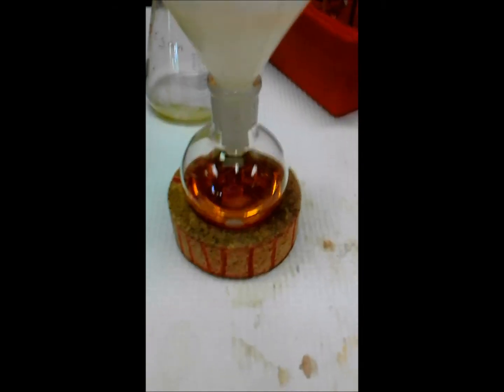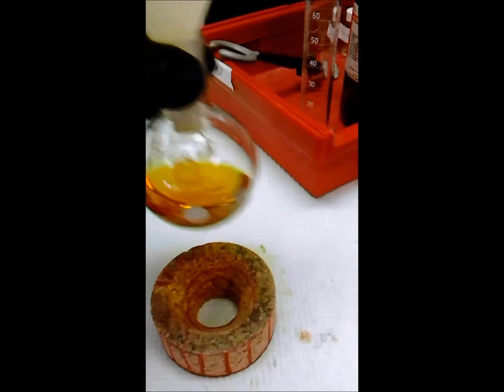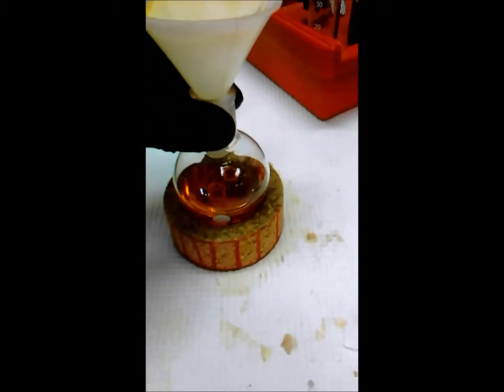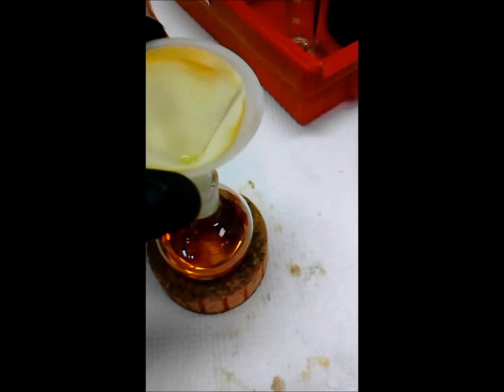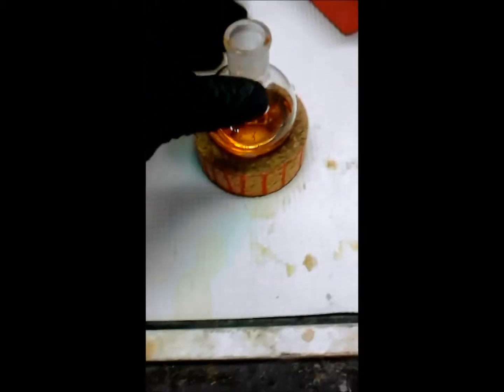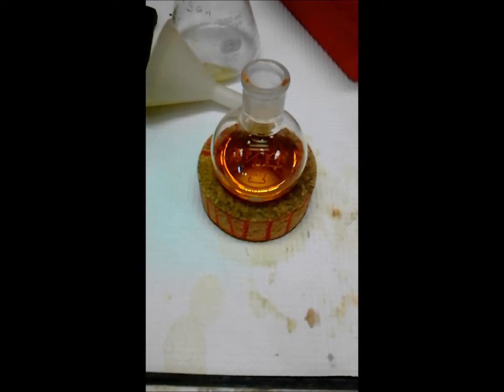Alright, so the sample's been dried. It's a nice clear orange color, pretty much. Probably going to take a sample and spot it quickly on a TLC plate. Yeah, that's pretty much done. And then we're going to write it up and hopefully get our recovered product.